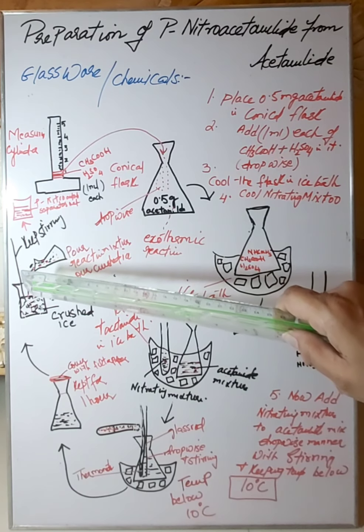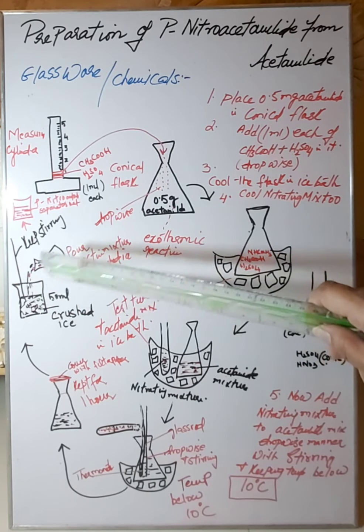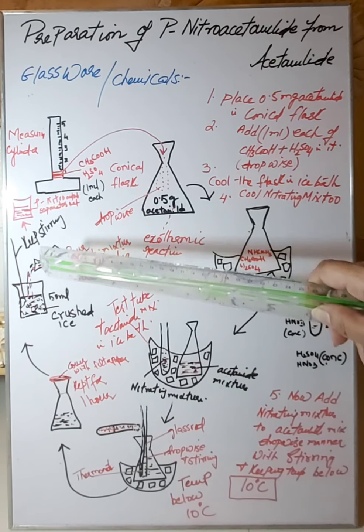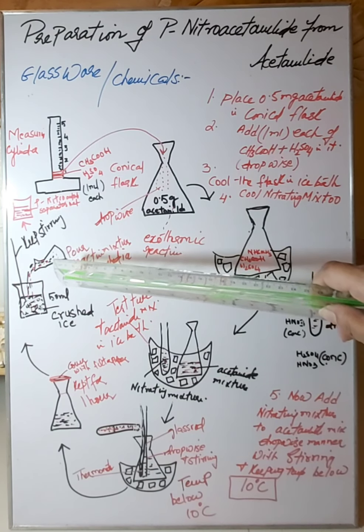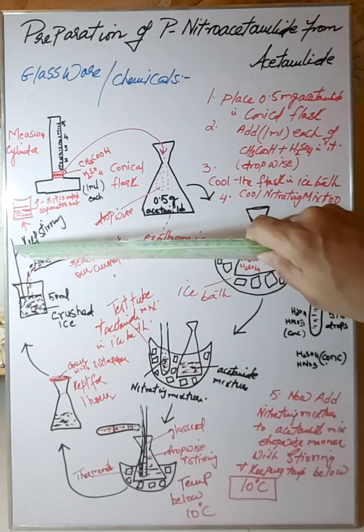So after the washing, you are going to take it out onto some sort of filter paper, right? And you will dry it in the air first for a while, and then you are going to dry this residue in an oven at about 100 degrees centigrade, right? Then after this process, this process ends here.